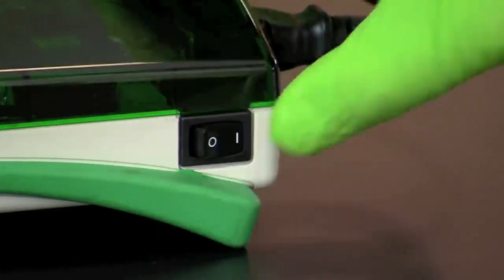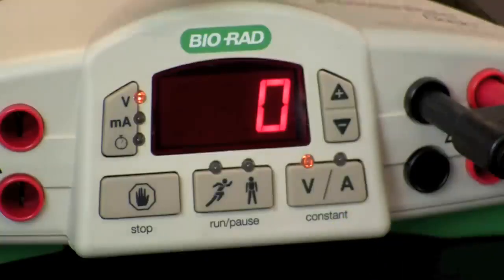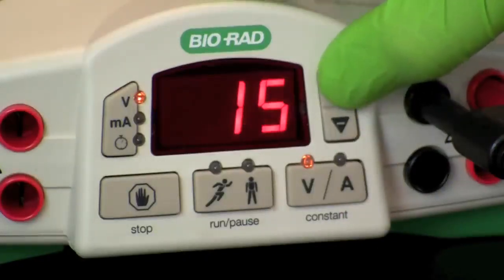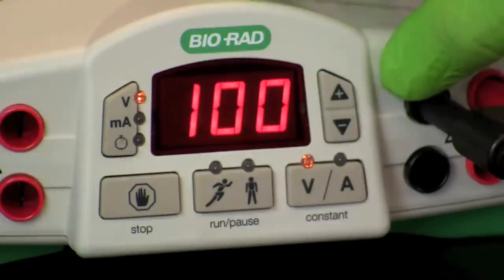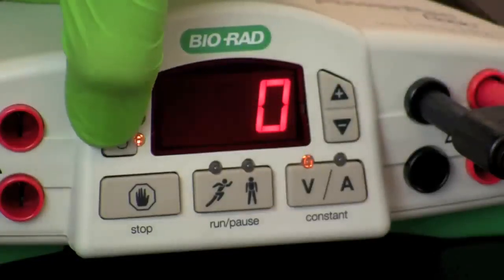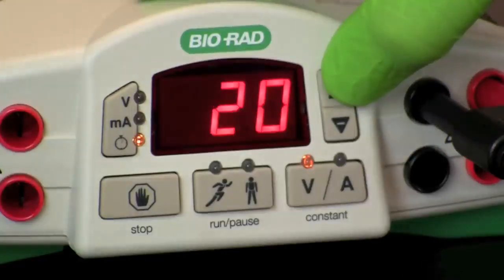Switch the power supply on, then set the correct constant voltage for running the samples. See your lab protocol for this information. If a timer is available on your power supply, set the clock for the proper time for your run.